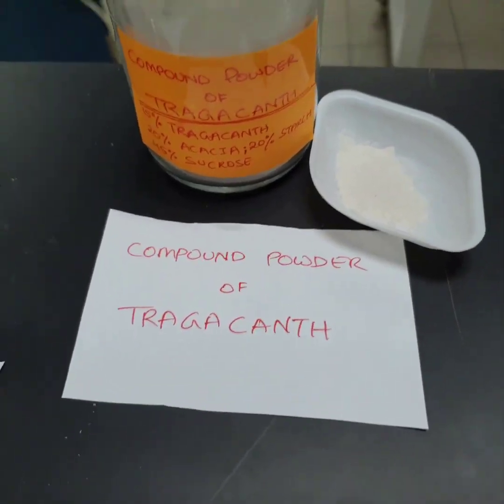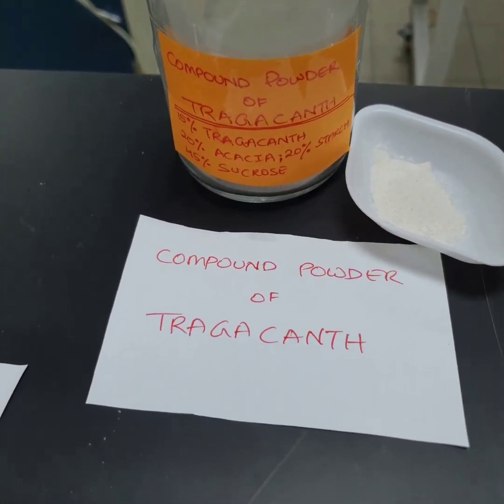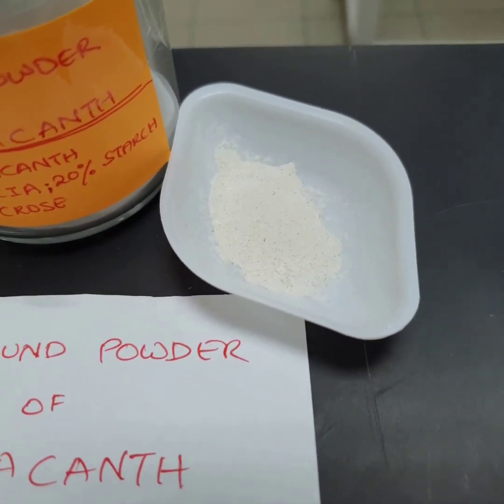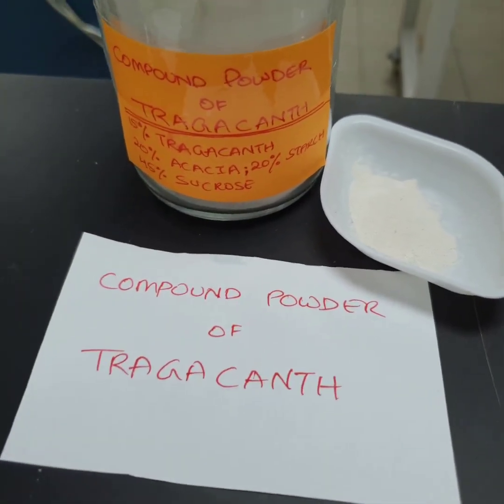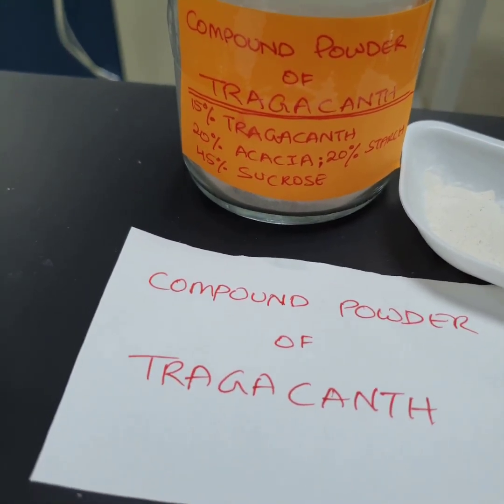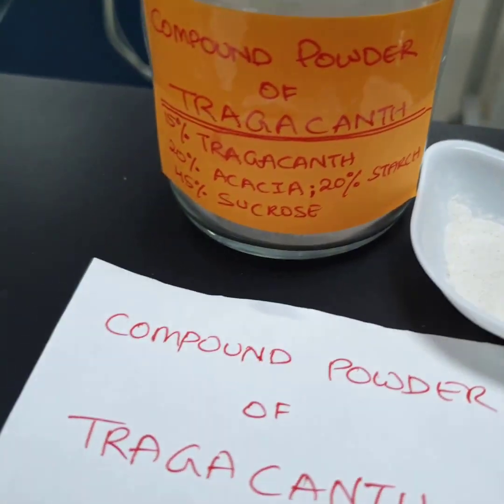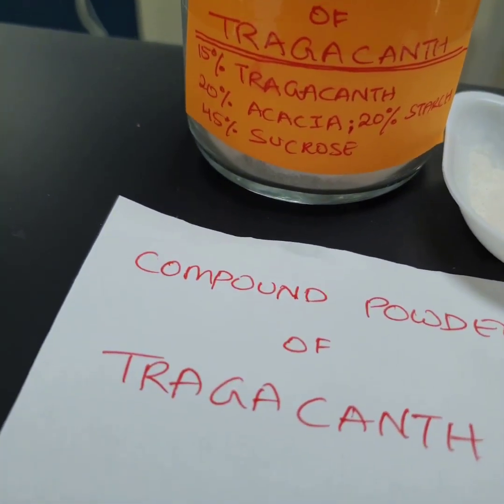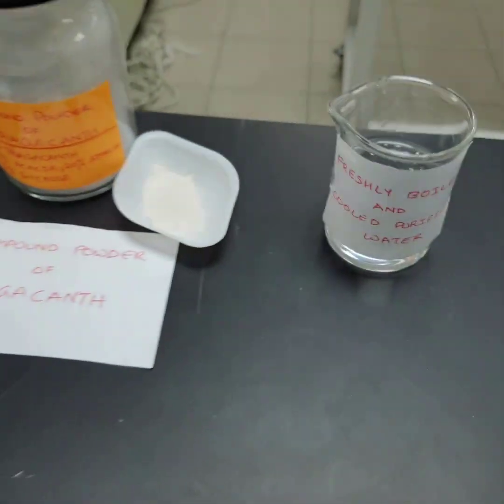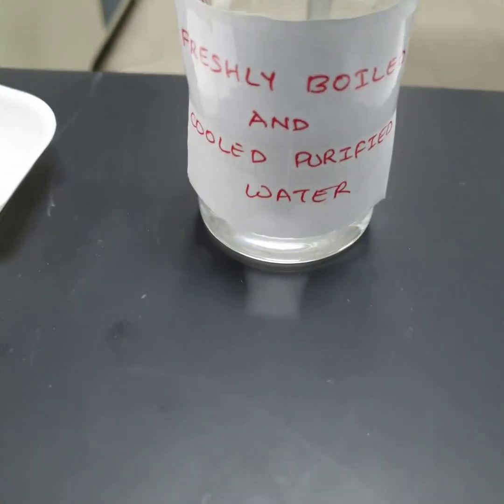And then this is the main ingredient, the suspending agent, which is called compound powder of tragacanth. I calculated it 1 gram here in the weighing pan for our clobazam suspension. This compound powder of tragacanth is prepared by adding 15% of tragacanth, 20% of acacia, 20% of starch and 45% of sucrose. When you mix these 4 ingredients, you will get this compound. Final volume will be adjusted with freshly boiled and cooled purified water.